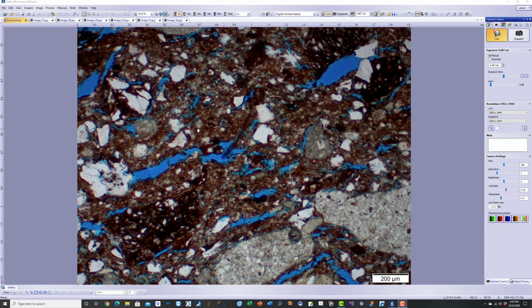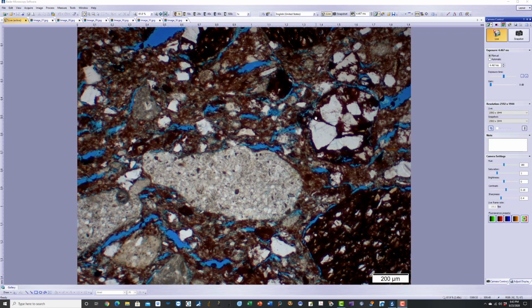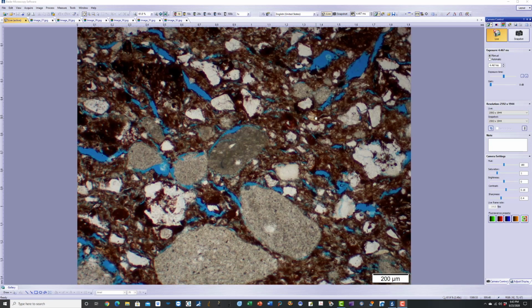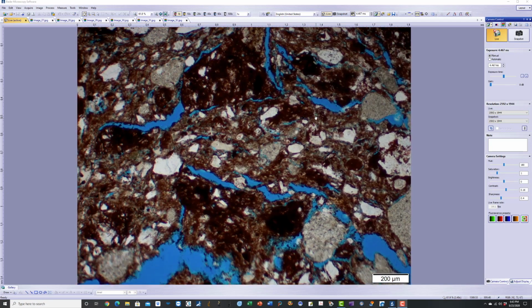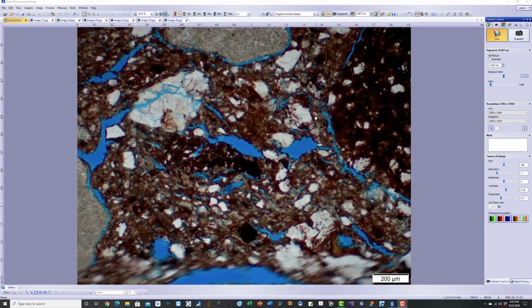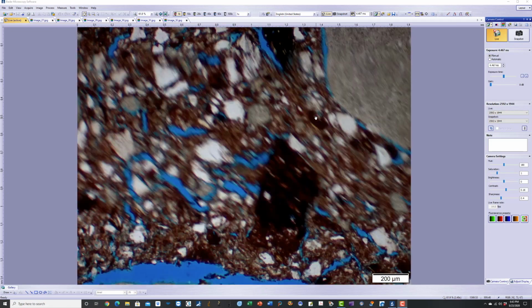Mostly the fired clay matrix is aluminosilicate glass with different degrees of firing of the original clay matrix. That's the plastic component. And then the non-plastic components are tempered additives, which are added for improved performance of the brick, as well as the original components of the clay.